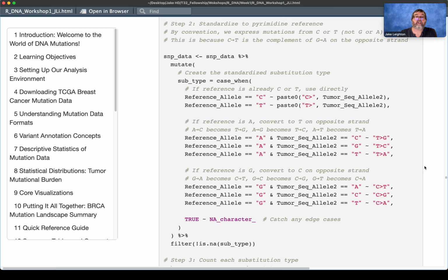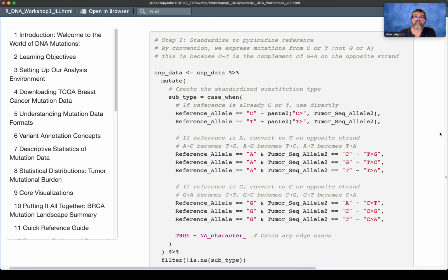So we just have our SNP data, and I'm making it simplified. If you see a C, greater than sign, I'm just making it a C. I'm simplifying things here for you, and I standardized this. Basically, I'm referencing these to the standardized version, just so you don't get confused. Sorry about that, I forgot this comes after.